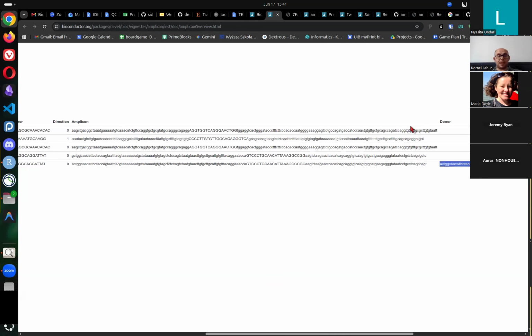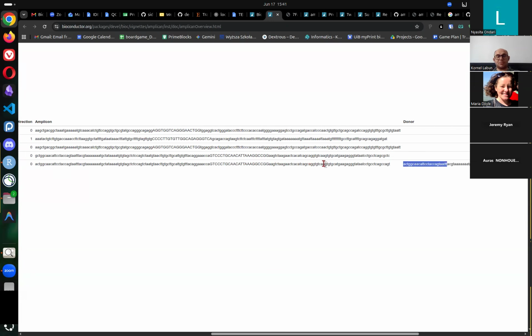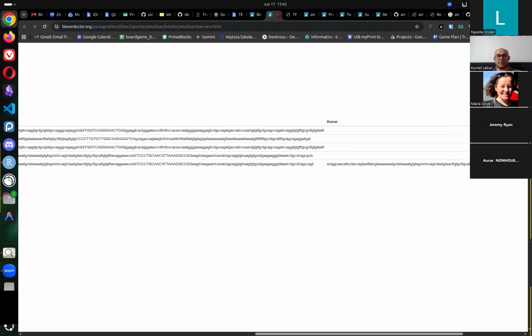It's best if your amplicon sequences are starting with a primer, and then they end with a primer. And then the best is if this one can also start with a primer and end, so that the only difference is what you expect to insert there, or like find the extras. Maybe you are fixing a single base or something.